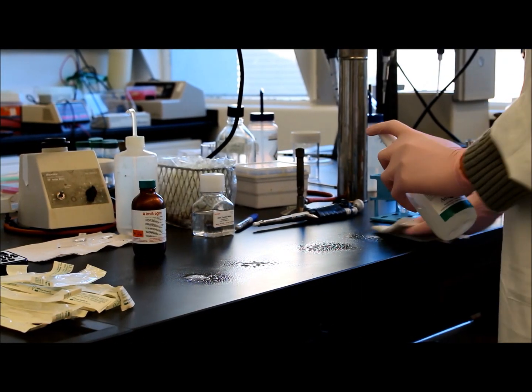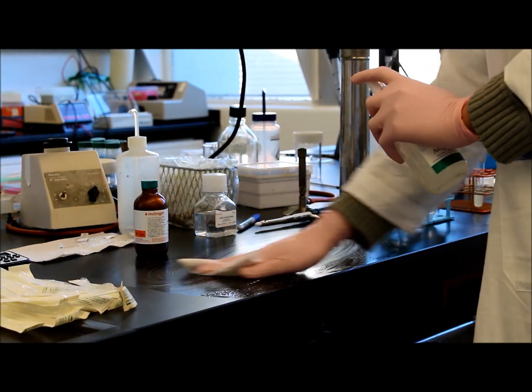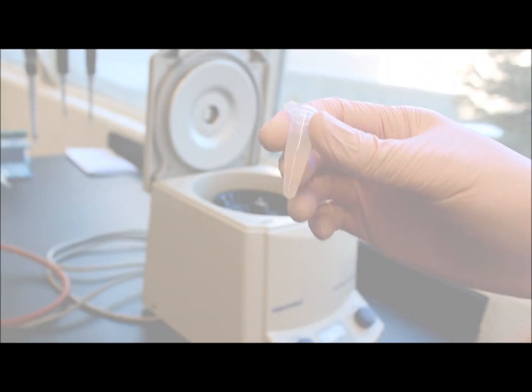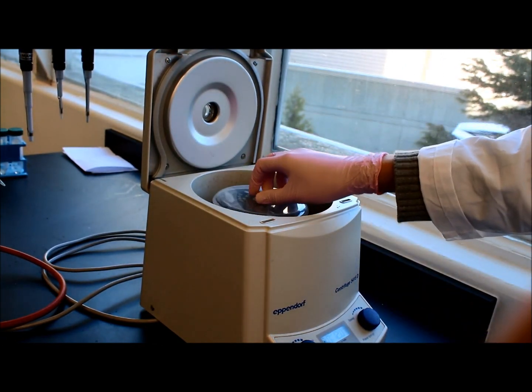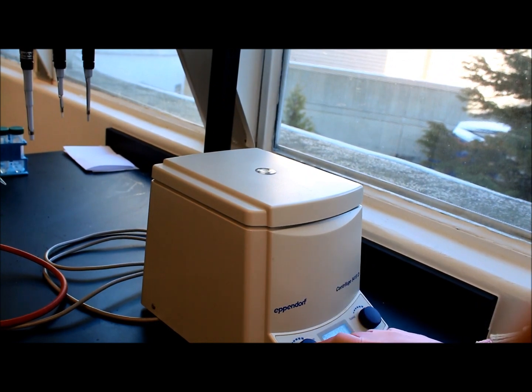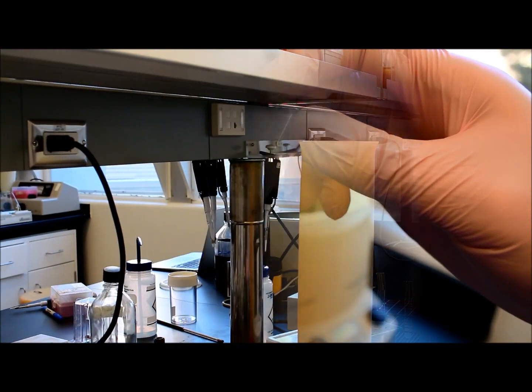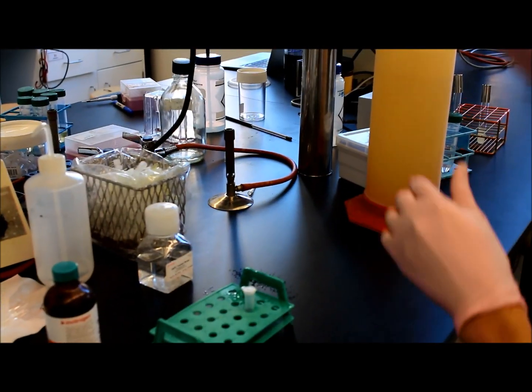Before starting, make sure your working area is cleaned with RNA Zap. The first step is the homogenization step. Pellet all the bacterial cells growing overnight by centrifuging at 12,000 Gs for 2 minutes. After centrifugation, the Luria broth supernatant is then decanted.